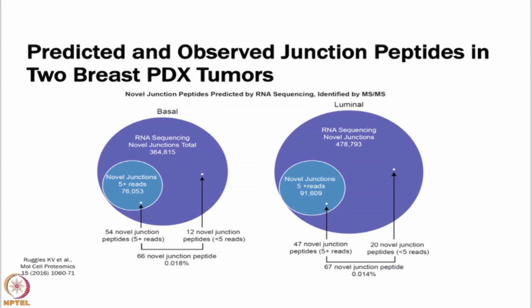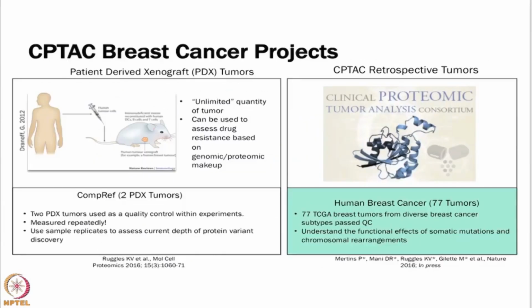I think this also shows how well the human genome is annotated. If this was a less annotated species, we'd find a whole lot more new splice sites.